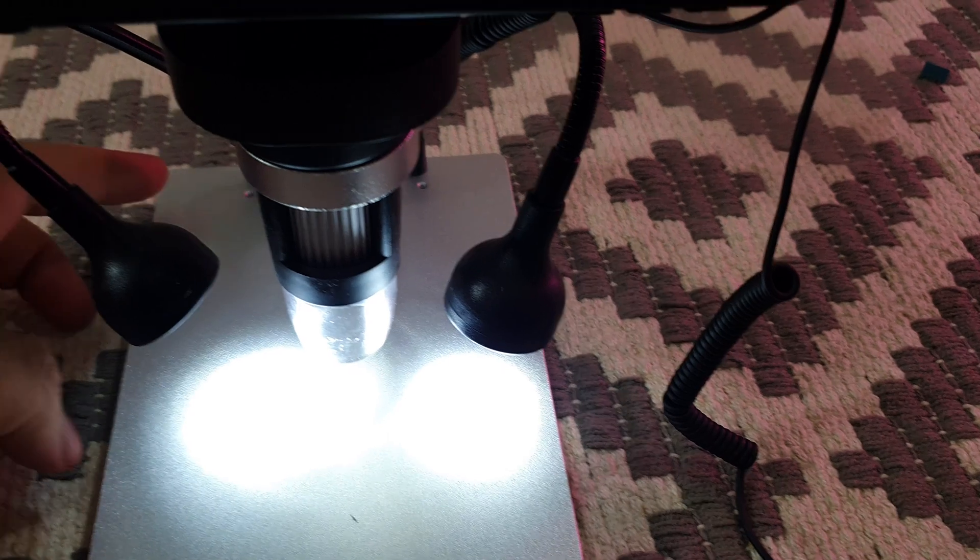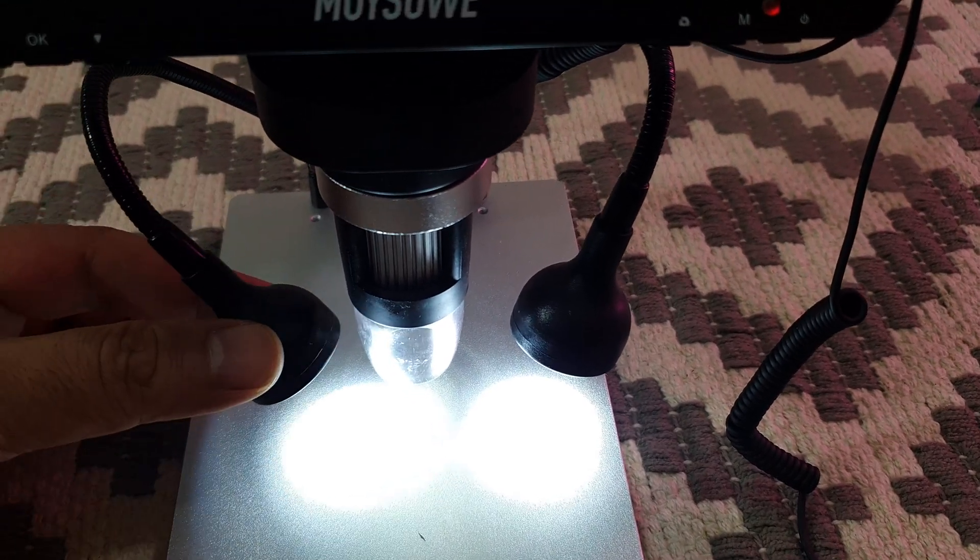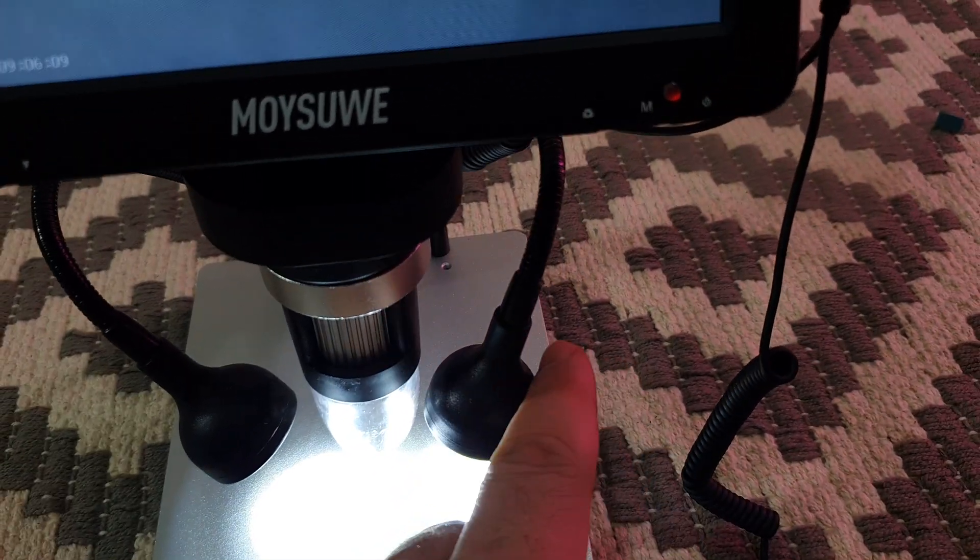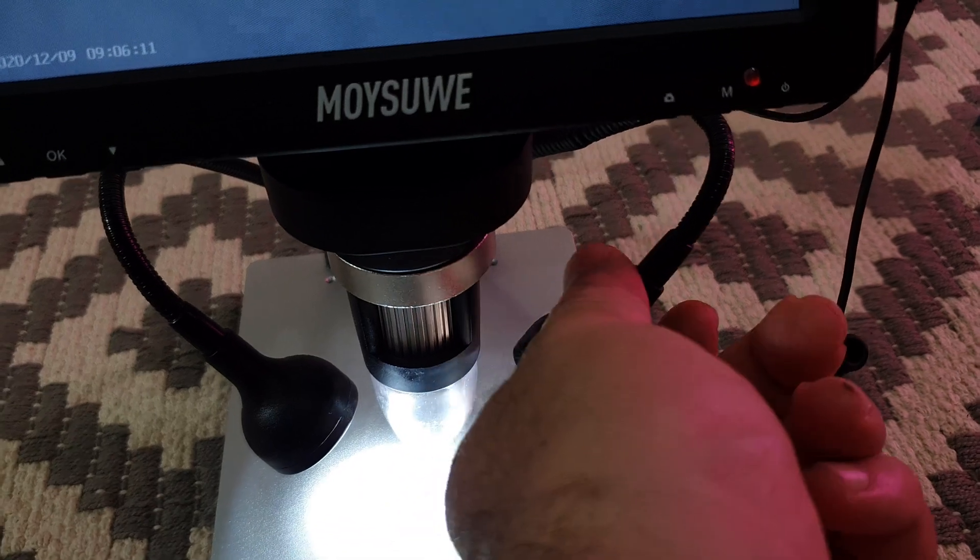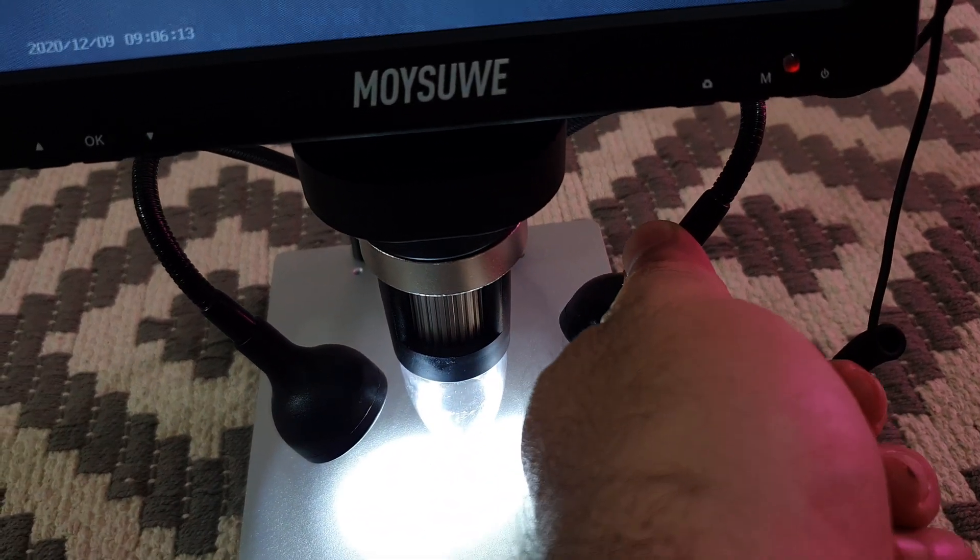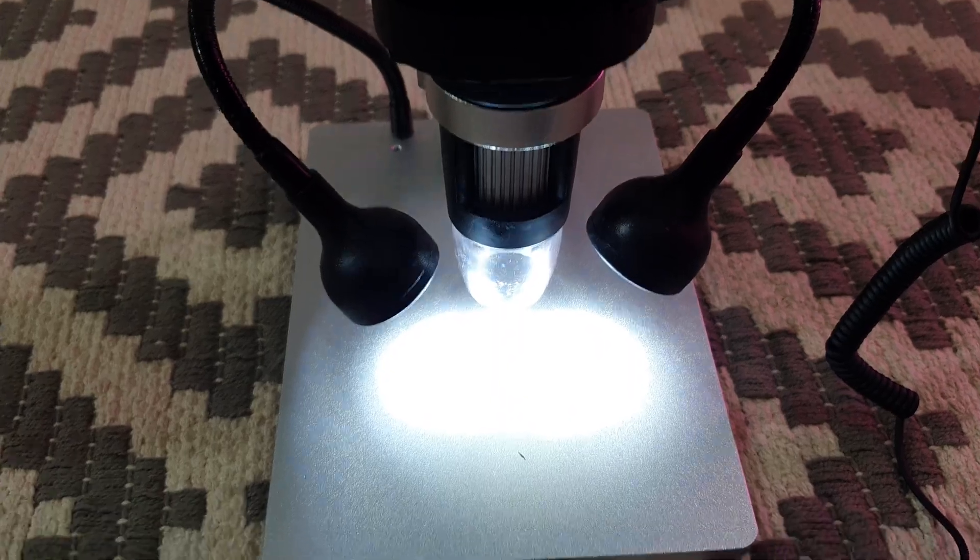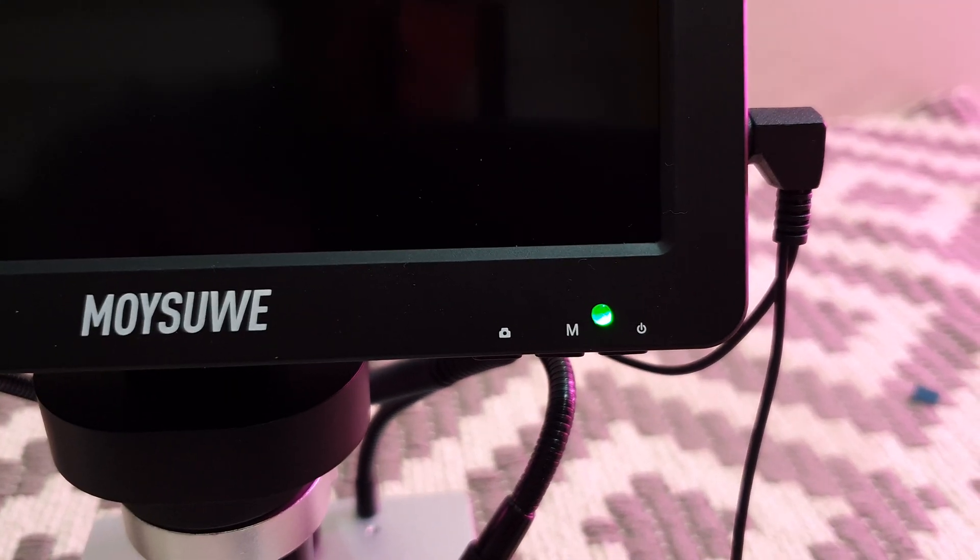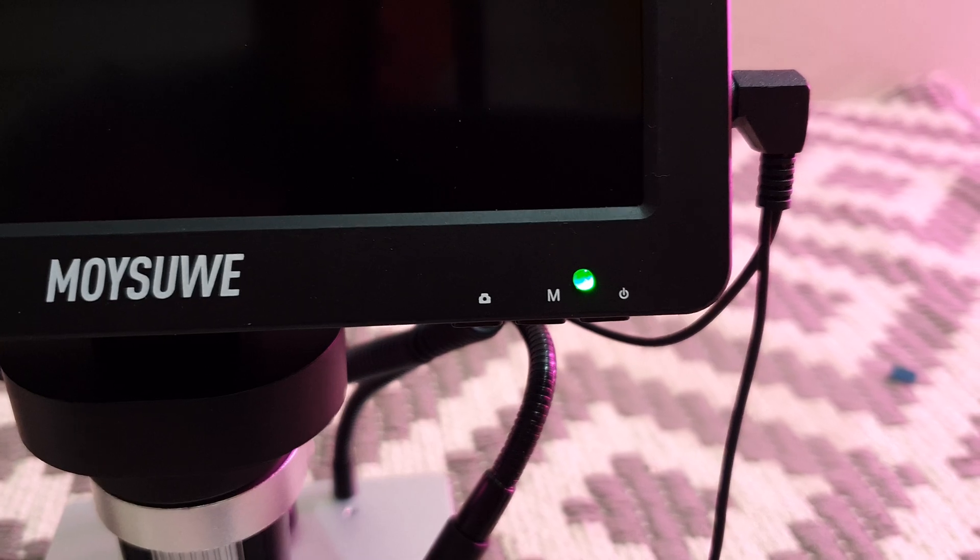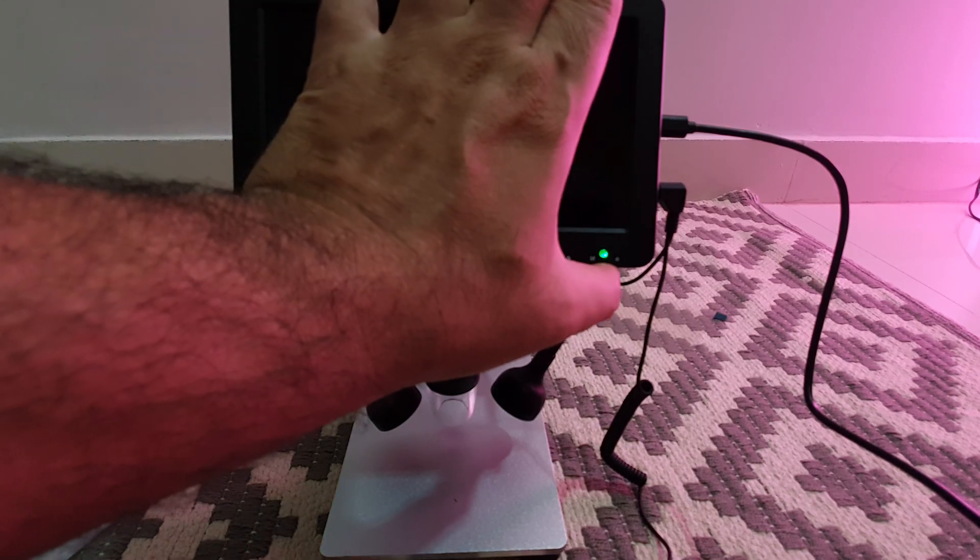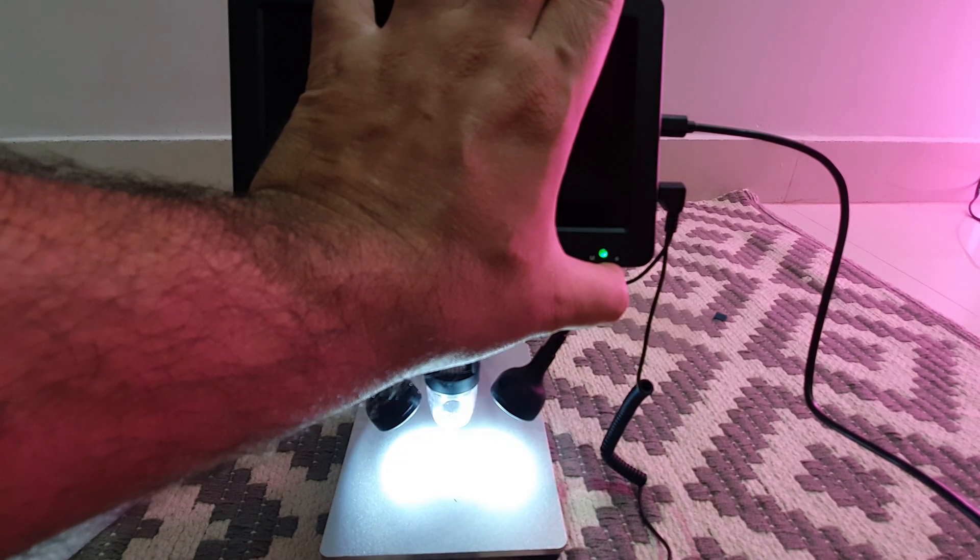Let's put this piece of wire here. Yeah this is nice. And the goose lights are on, and these are really adjustable thanks to that flexibility on the neck. It's amazing. You can see the unit is fully charged, the LEDs turn into green. I'm going to power it up again. Yeah it's really fast.